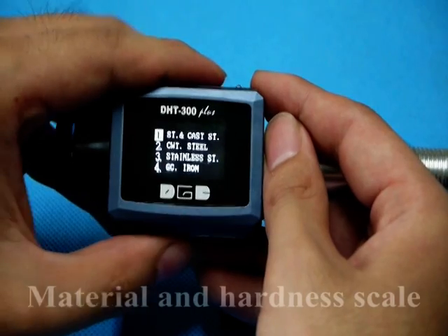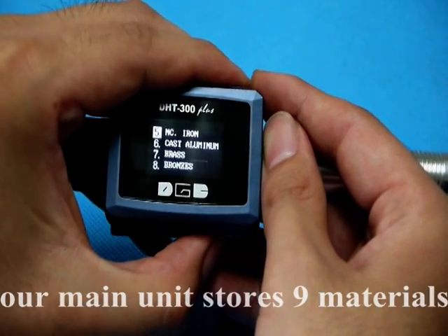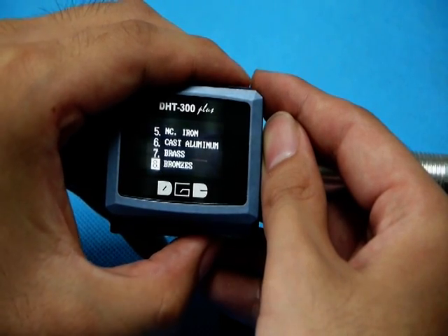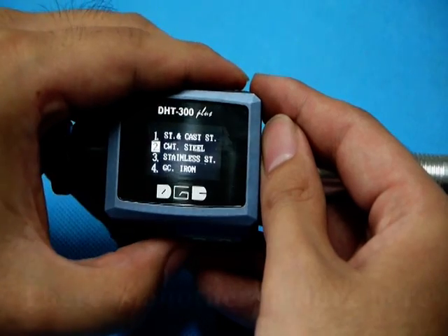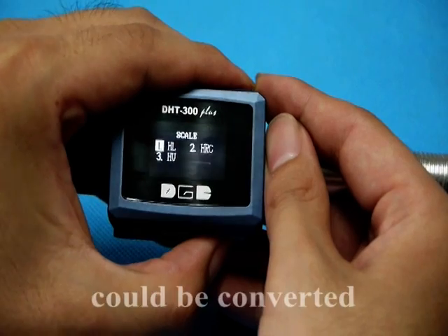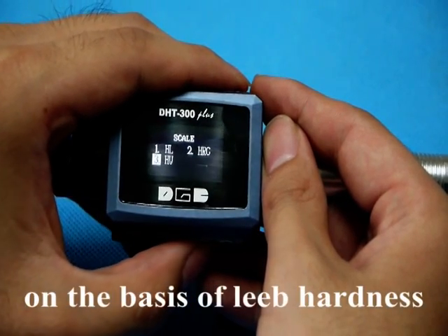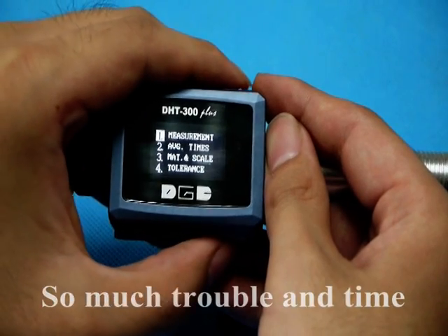The second one is material and hardness scale. Our main unit stores 9 materials. For easy choice, you could choose directly. If you select tool steel, for instance, only the hardness scale that could be converted on the basis of Leeb hardness will be shown here, so much trouble and time will be saved.